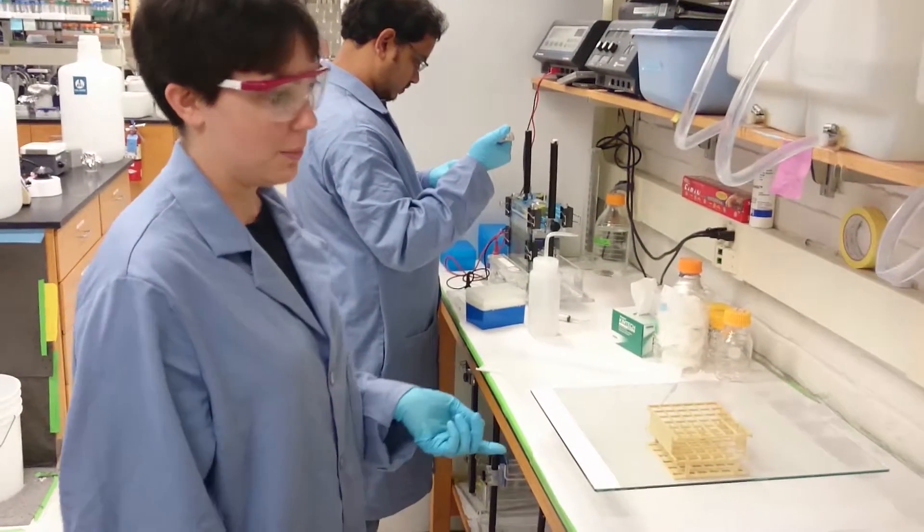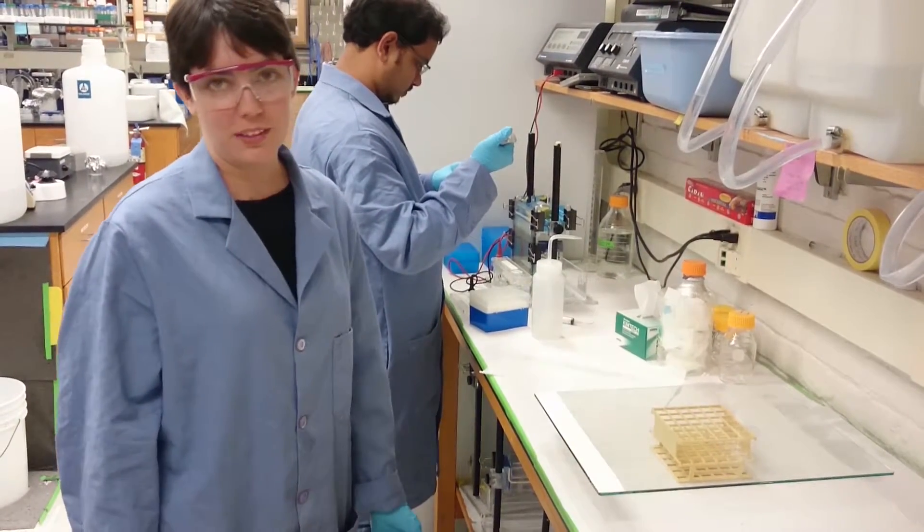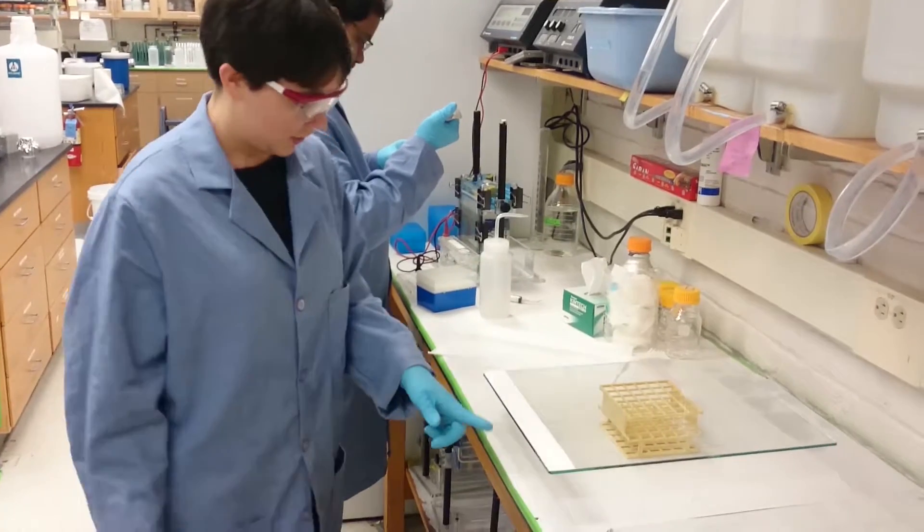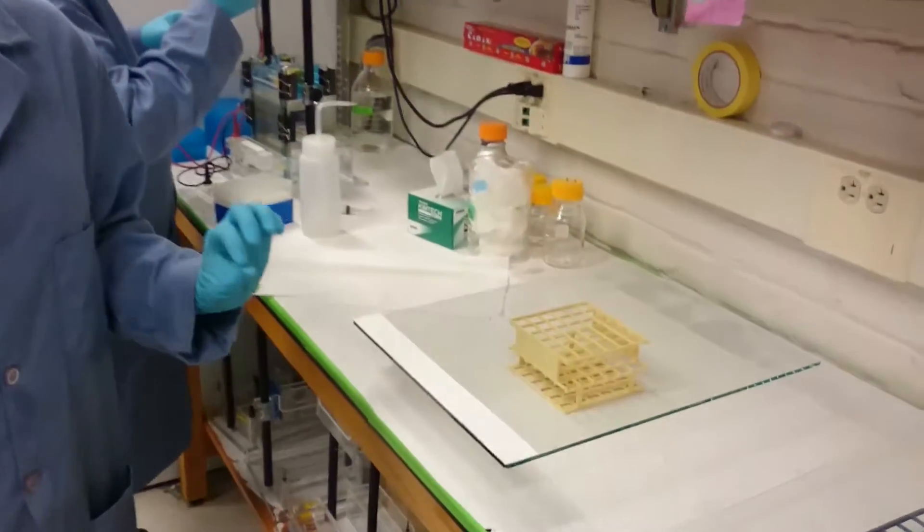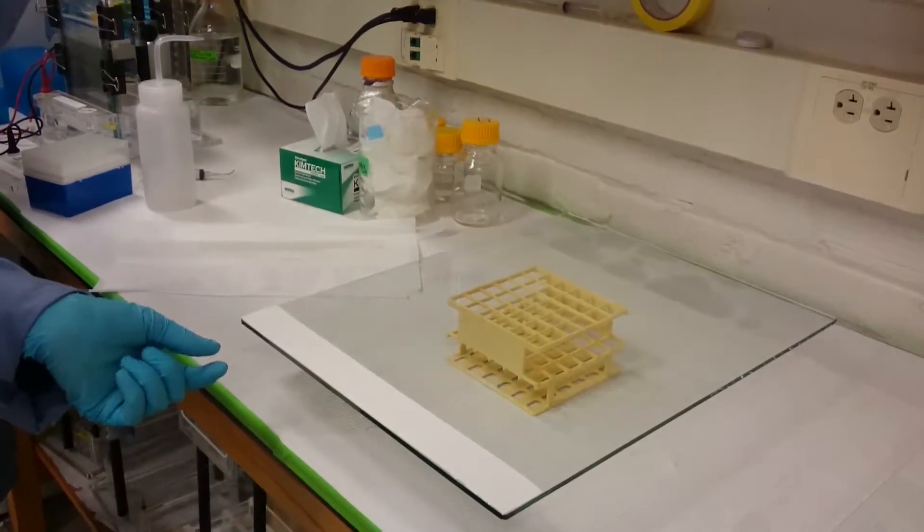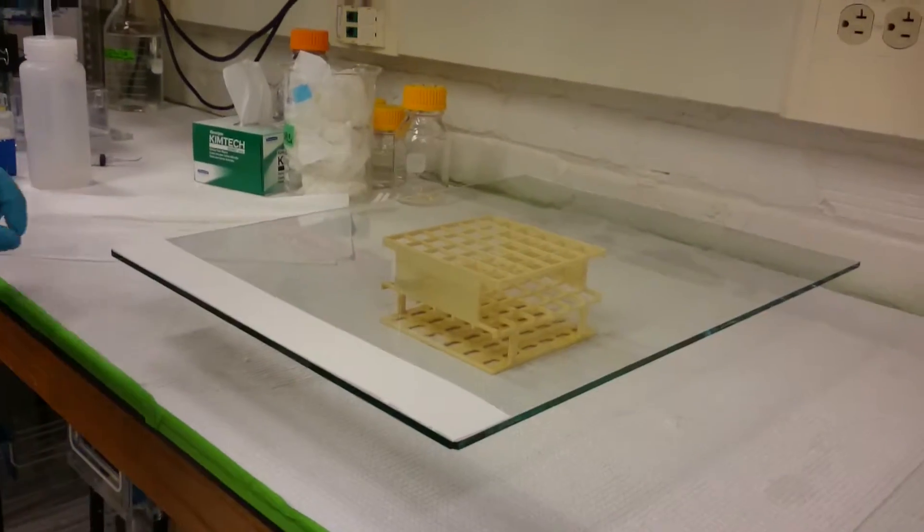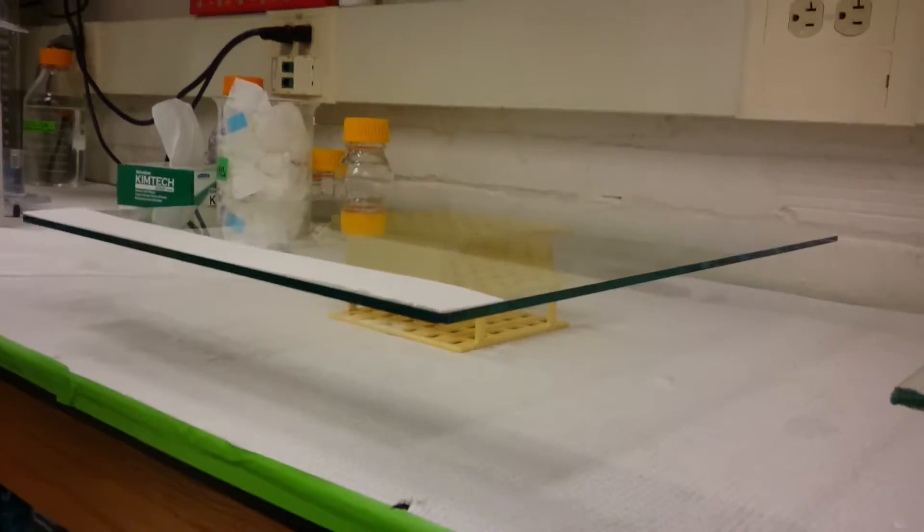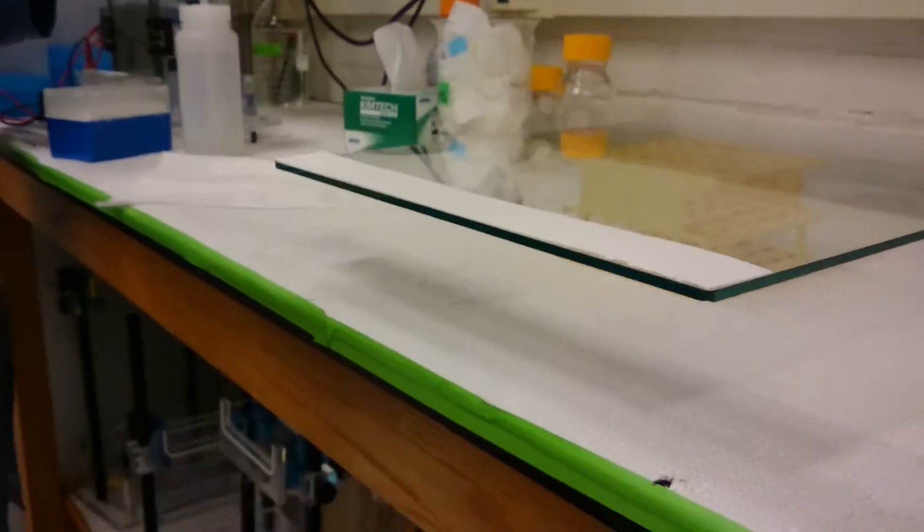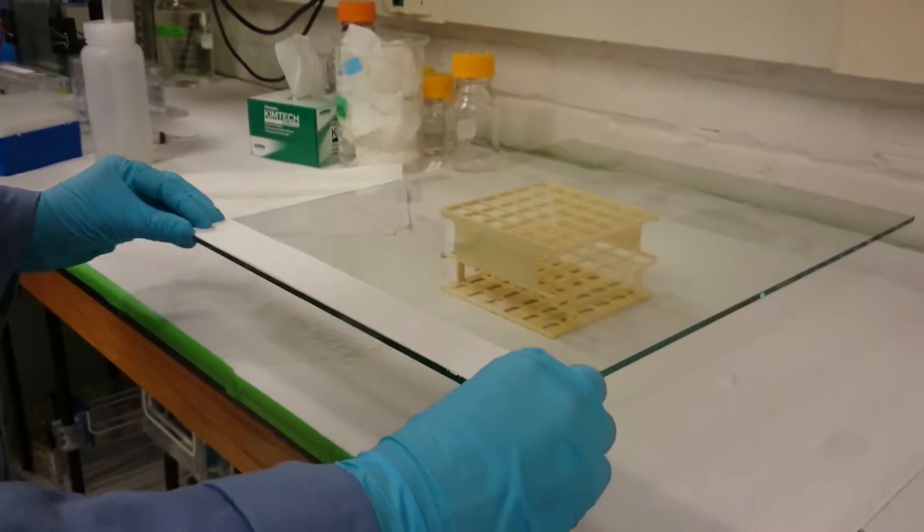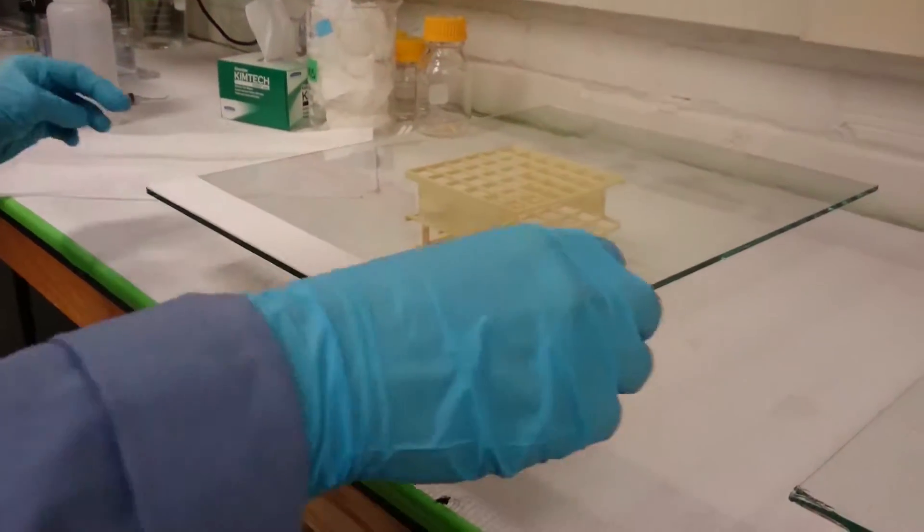And now I'm going to assemble the two plates so that I'm ready to pour the gel. So here at the bottom I've put a stack of two sheets of thick filter paper. Two of them are just about the same thickness as the bottom of our spacers, and I've cut it so that they're just the width of the plate.